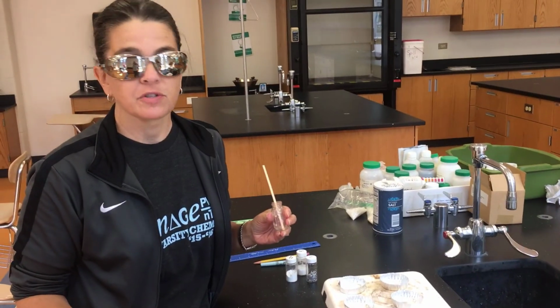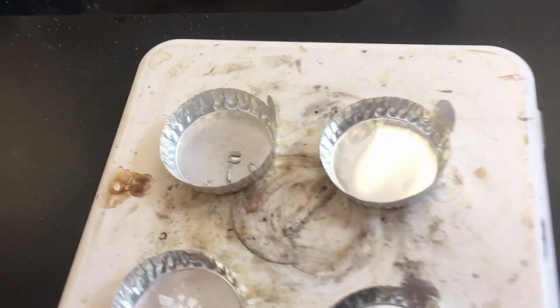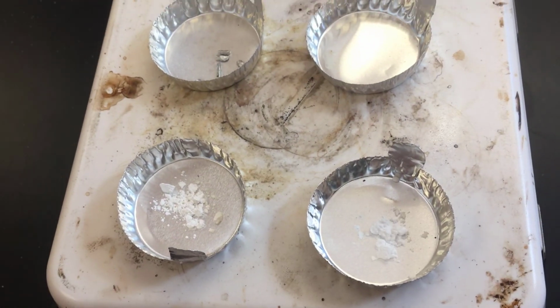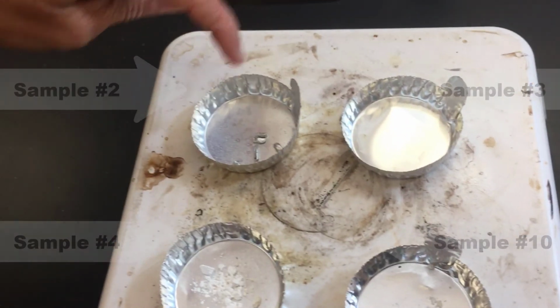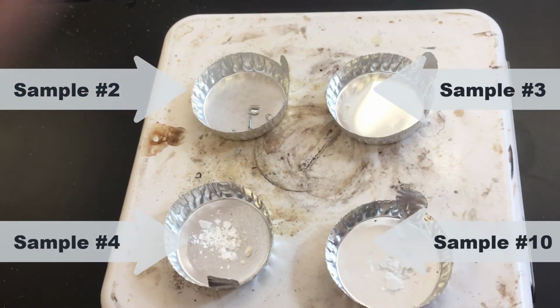Okay, for our final test, relative melting temperatures. So I already have 3 substances in there. Just for the sake of clarity, I saved 1 to add in as we started the video. This is 2. I'm going to put 3 here. This is 4, and this is 10.